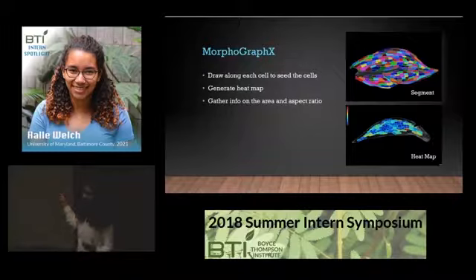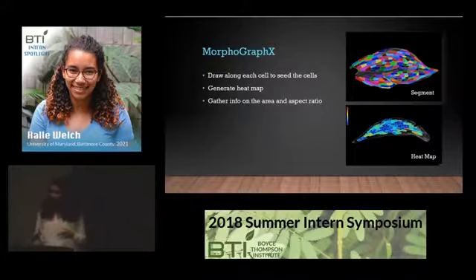And then our next step would be to use the heat map, and the heat map would gather information on the area, the aspect ratio, and any other specifications that we wanted.